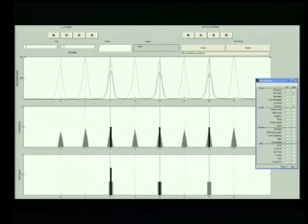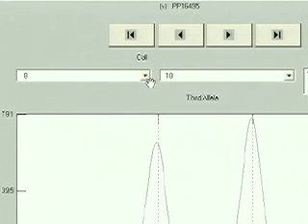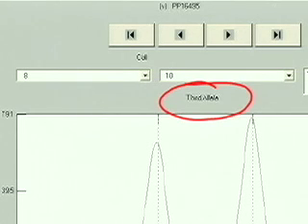I want to bring your attention to the upper left-hand corner where in True Allele System 2, they have a designation up here that shows up when in fact a third allele has been called. In True Allele System 2, the software has accurately called all 3 alleles.